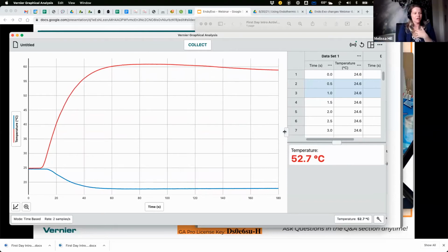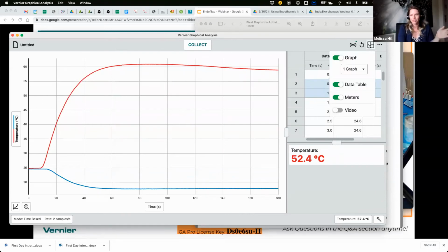I just want to make a quick comment. When you were playing around with all the views and the presentation and stuff, my screen, because I'm following your data sharing session, went totally gray. And it basically, I guess, disabled all the graph and tables. So if that happened to anyone else out there, just go into that little graph view icon again, view options, and enable the graph, enable what you want.